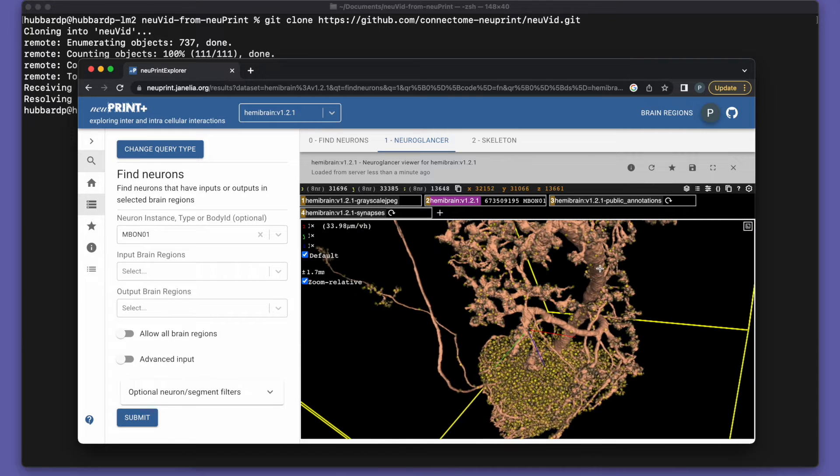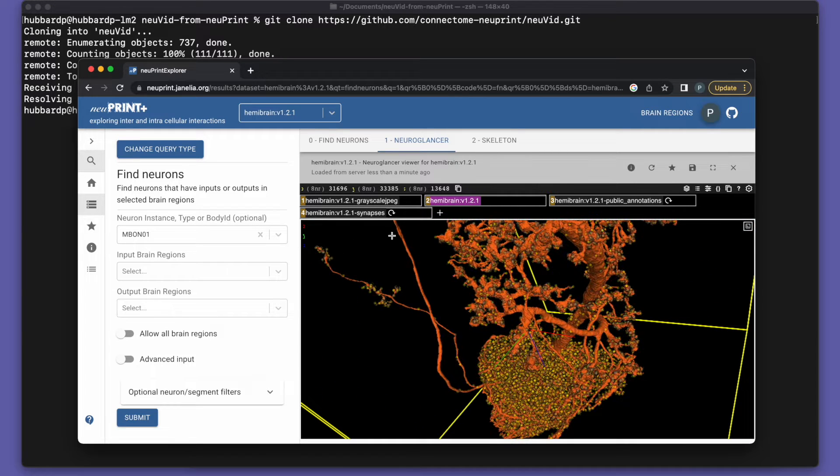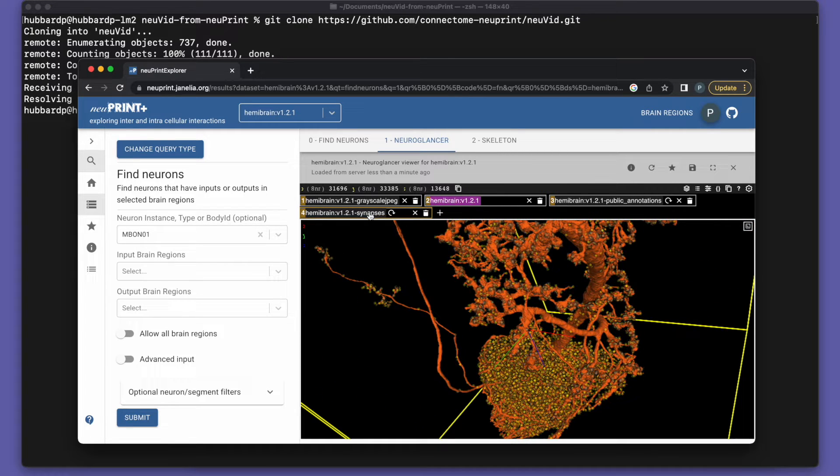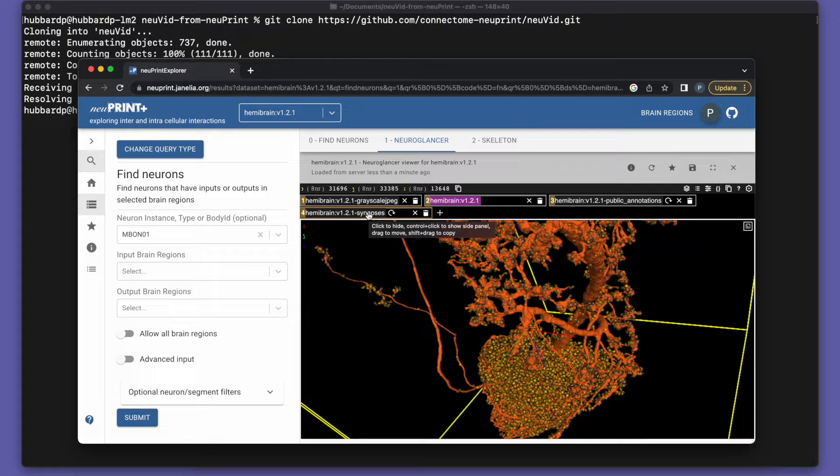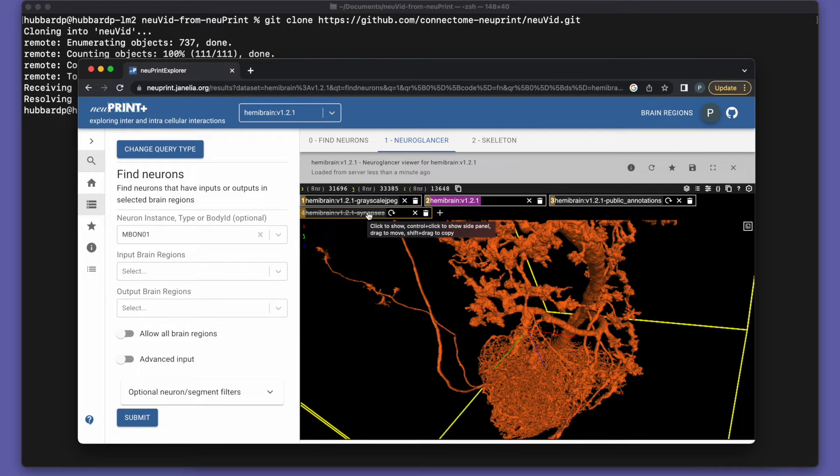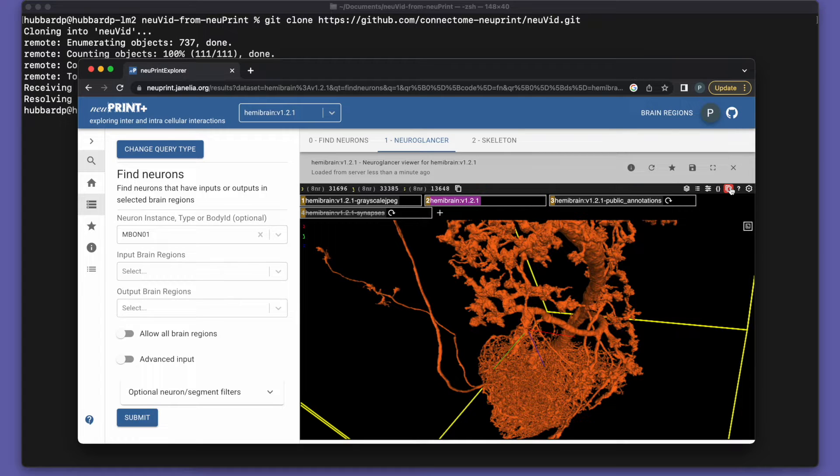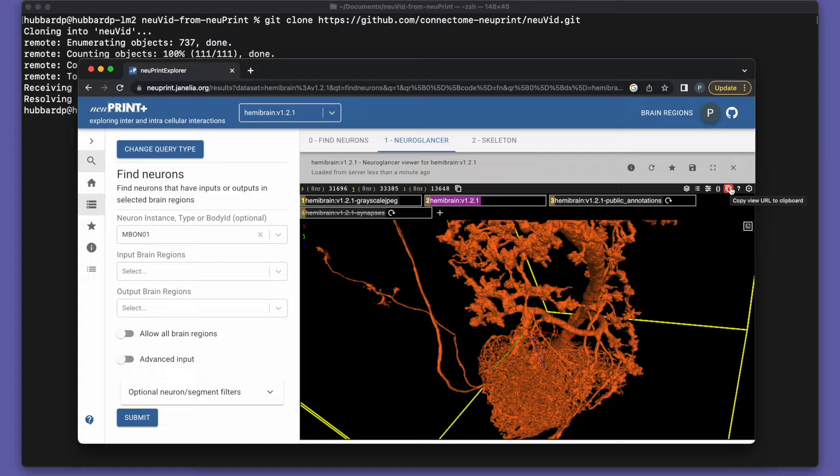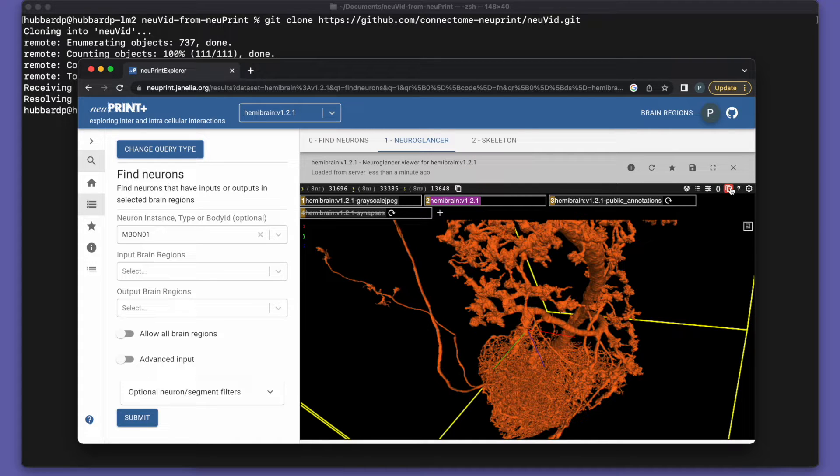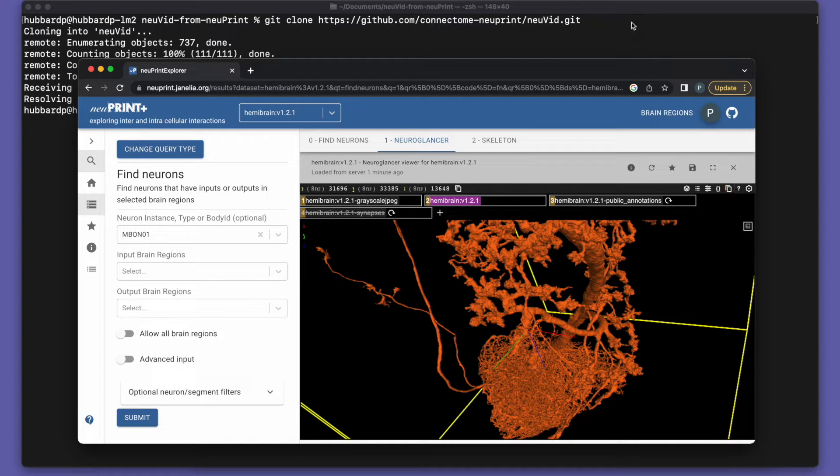For the first video we're making, we don't really want to see synapses. So I'll left click on this tab here to make them go away. Now I come over to this button, Copy View URL to Clipboard. I press that and the clipboard gets the information about what NeuroGlancer is showing. And then we can import that into NuVid.